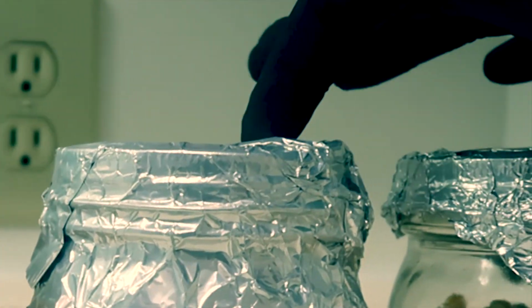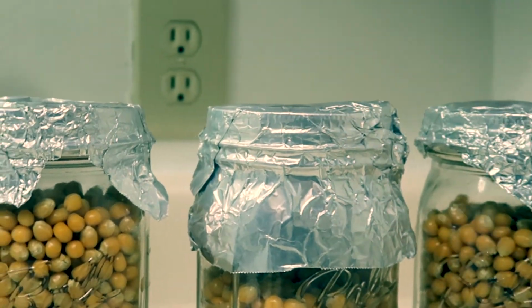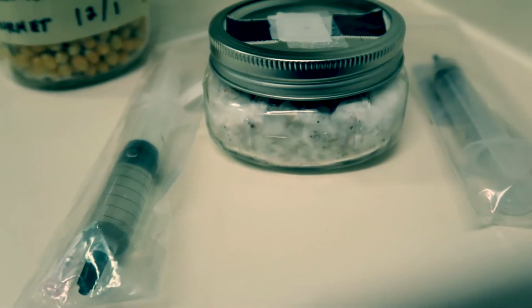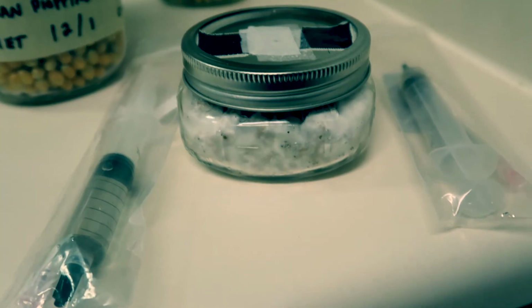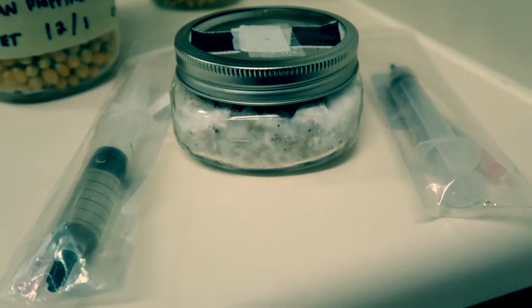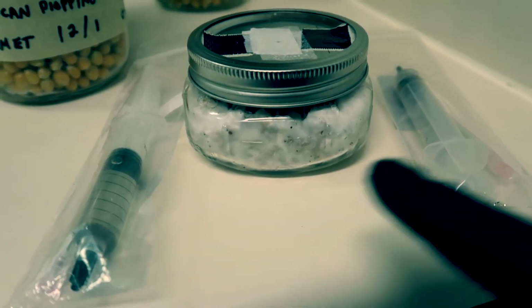Since we have our lids upside down, it's going to be easier for the mycelium to breathe through the loose lids. And don't forget, whether you've got fully colonized grain or liquid culture syringe or spore syringe, you can always store it in your refrigerator for when you need it next. You just don't want the stuff to freeze. As long as you keep it in a cool, dark spot, the stuff will last for a very long time.